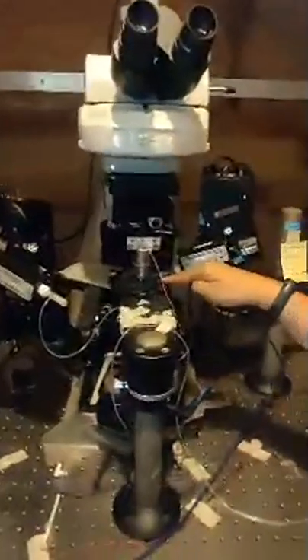If you come here, what I can show you is this chamber. This is the place where we actually get the electrical recordings, which can show what those swims that you saw in the prep look like. This is a very fancy microscope. This is just the simple microscope, and this is the place where the prep is kept. These things are common to all microscopes, the place where you keep the sample. But what are these?